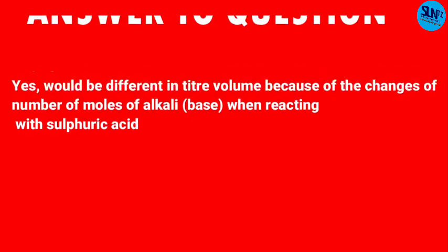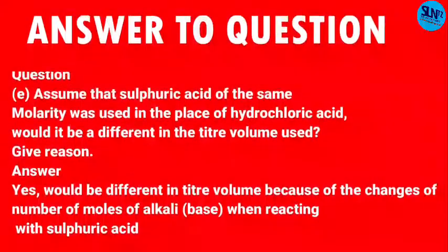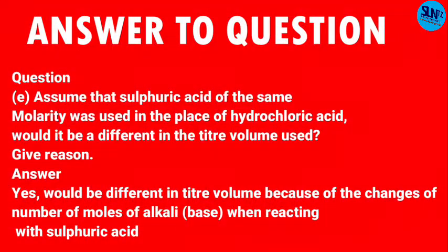Yes, it would be different in titre volume because of the change in the number of moles of base, or alkali solution, when reacting with sulfuric acid. So the titre volume will be different because the number of moles of base has changed when we use the sulfuric acid.